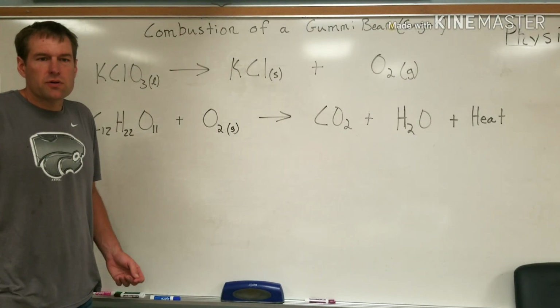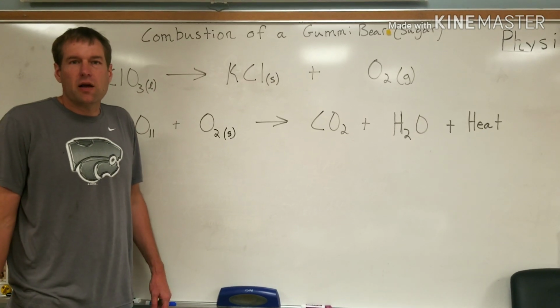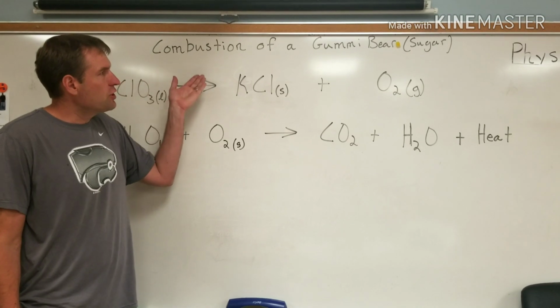Okay, we're back in the chemistry classroom again, ready to do another chemistry demonstration. As always, back behind the camera, my son Ethan. Say hi, Ethan. Hello. So today we're going to look at the combustion of a gummy bear.